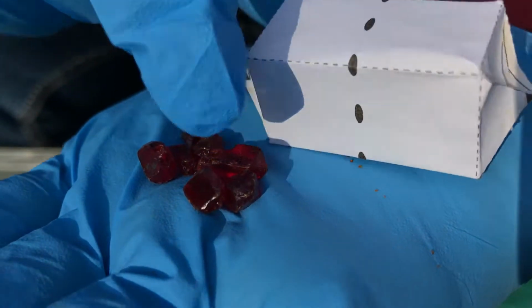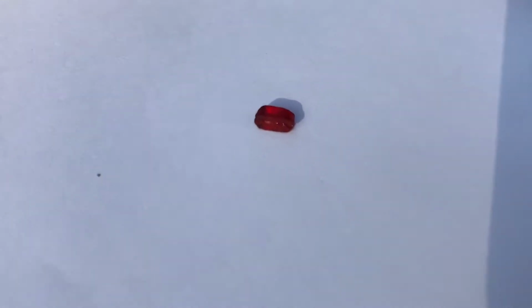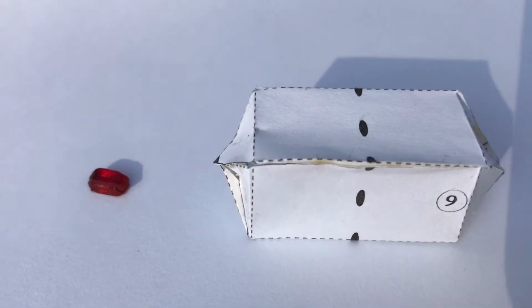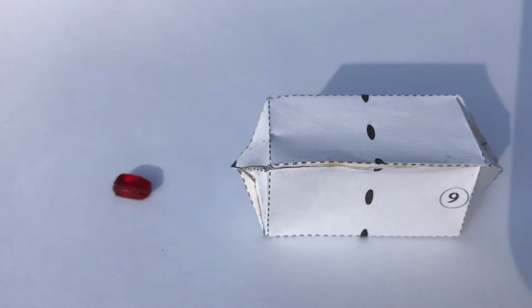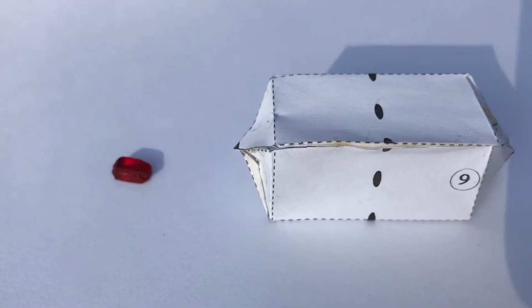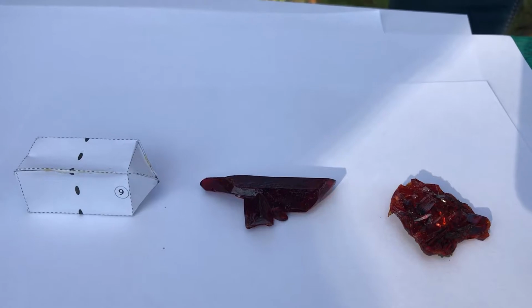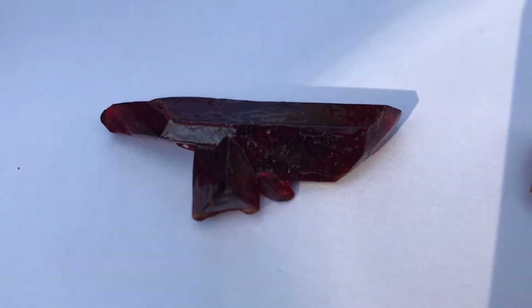It is desirable when growing the crystals to store the solution container in a closet or in any other confined space. It is necessary to prevent dust from entering the solution, as the impurities can make the final crystal not clear or to grow with a different geometrical shape like in my crystals.